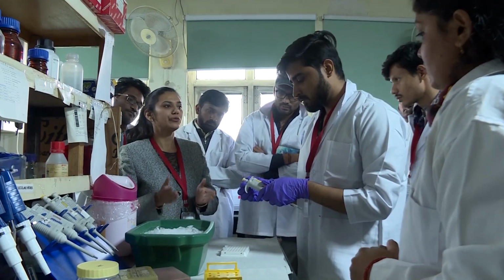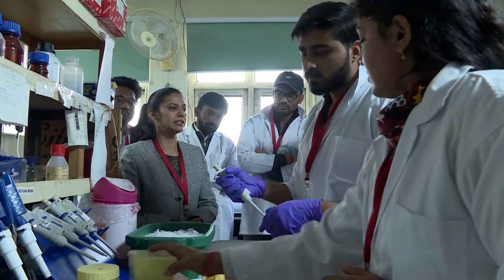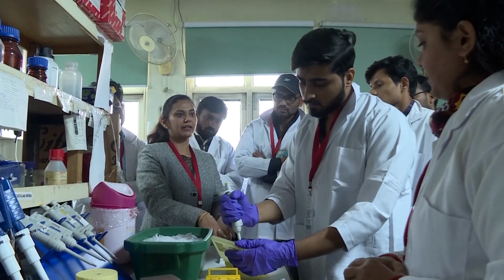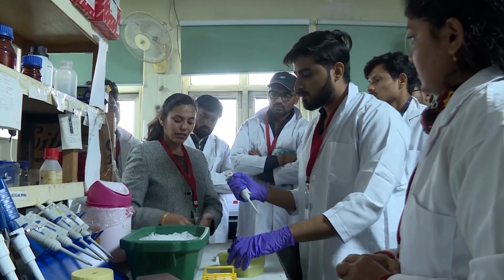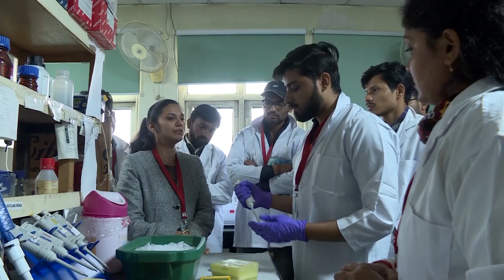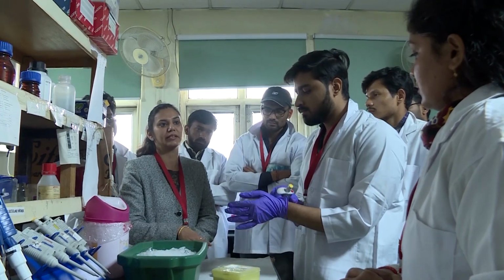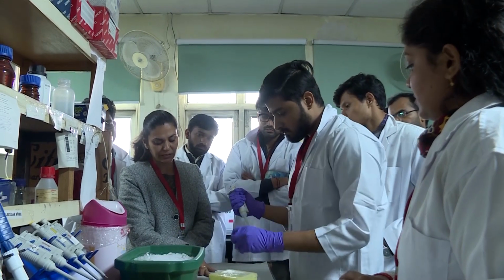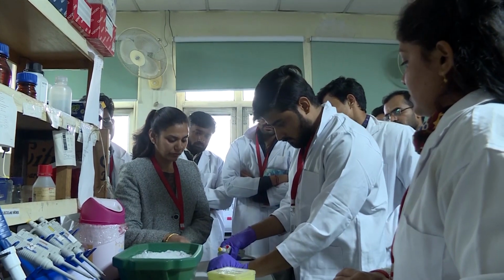Whenever you are going to do real-time expression profiling, before performing it directly, you first have to calculate and write it down in front of you, so that it will be easy for you to set the reaction. So just distribute this in all the 4 tubes, 36.4 in each tube.